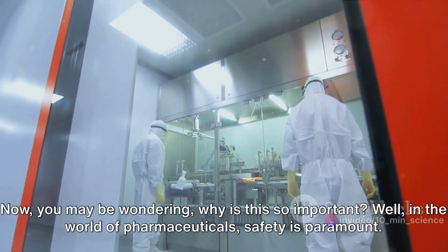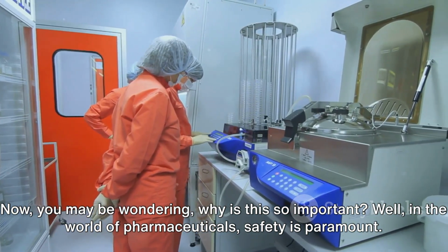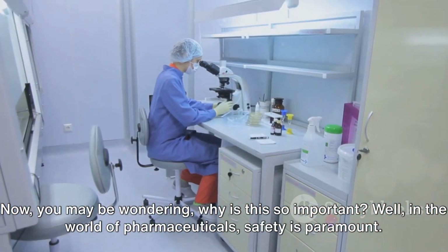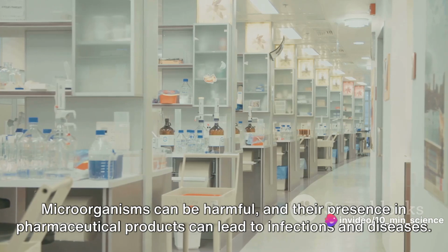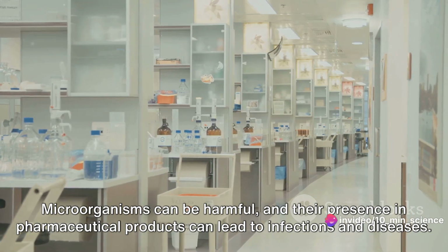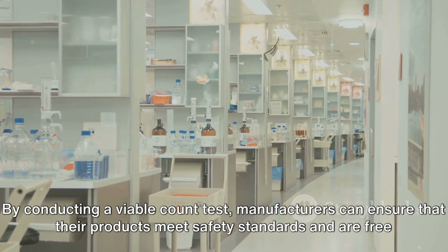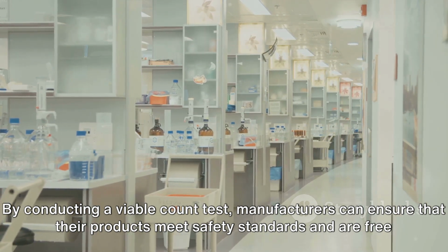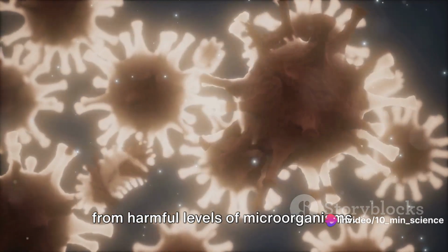Now, you may be wondering, why is this so important? Well, in the world of pharmaceuticals, safety is paramount. Microorganisms can be harmful, and their presence in pharmaceutical products can lead to infections and diseases. By conducting a viable count test, manufacturers can ensure that their products meet safety standards and are free from harmful levels of microorganisms.